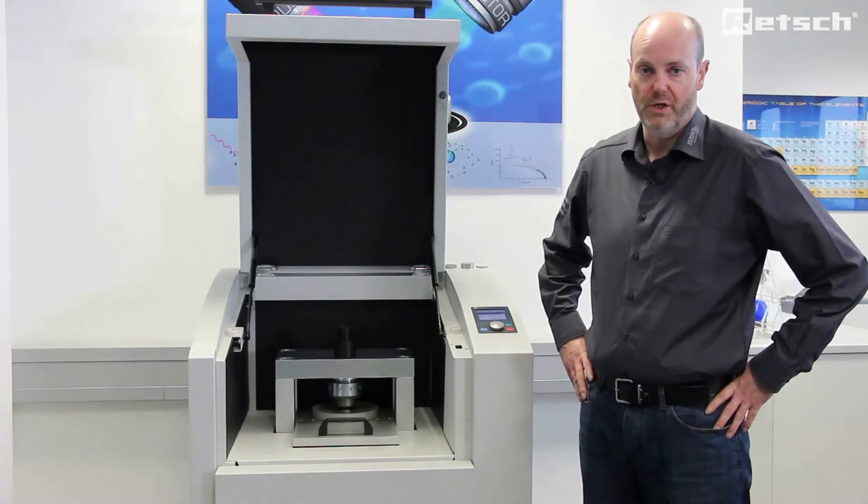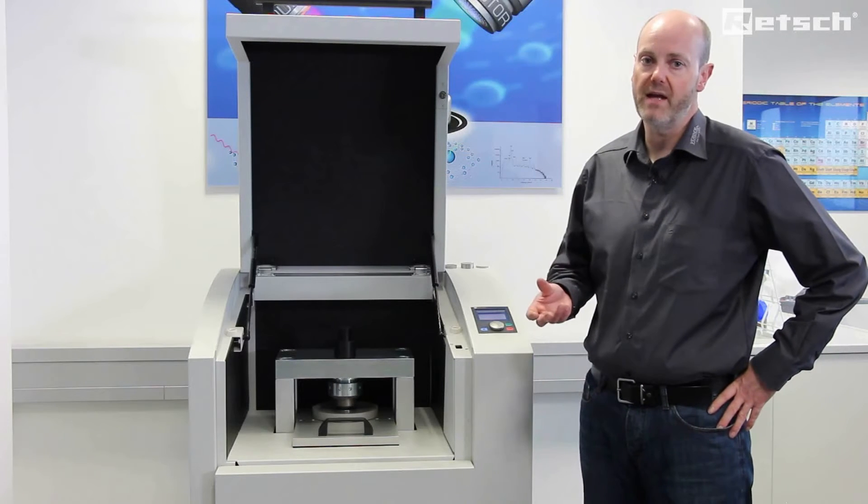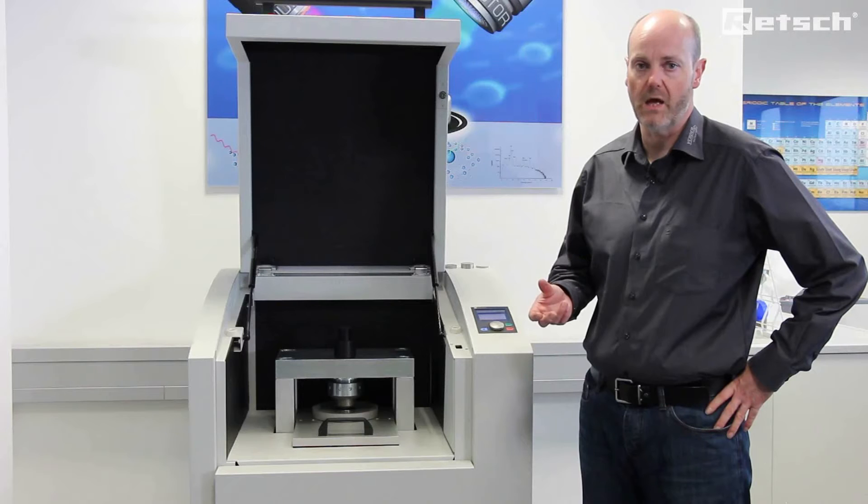The production of a crack-free, homogenous, smooth surface pellet is critical for getting the best XRF result from the analyzer.